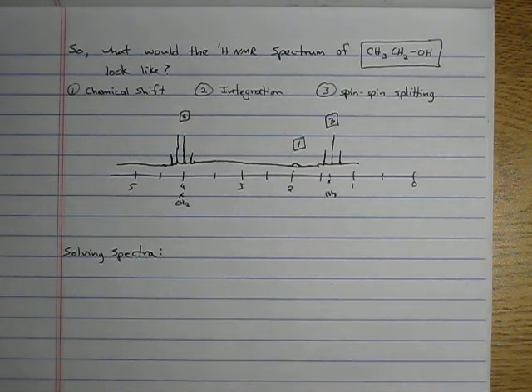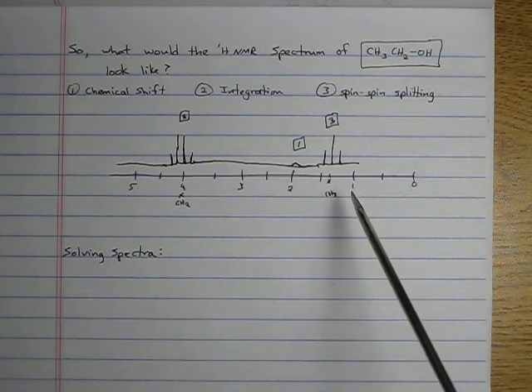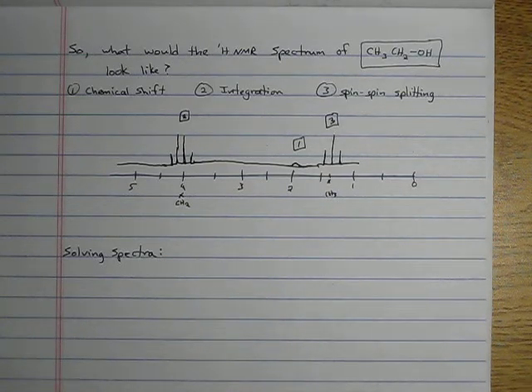All right, so when looking at proton NMR spectra, there are 2 things we tend to do. What we've done so far, with this last example, is: here's our molecule. What do you expect the proton NMR to look like? When you get into organic 2, that's a question you're going to have. Before you do a lab, you're going to try to make your product. You should know what the product is that you're going to make. You should be able to predict a fairly reasonable NMR spectrum. What do you think the proton NMR spectrum should look like? You should have a fairly good idea of that before you run it to see if you actually made your stuff.